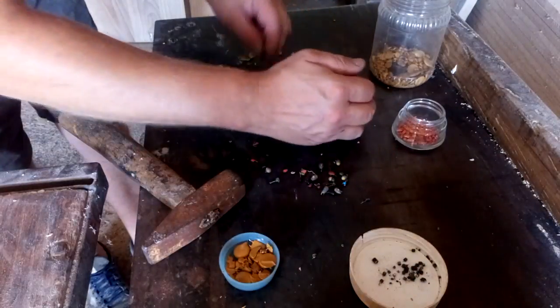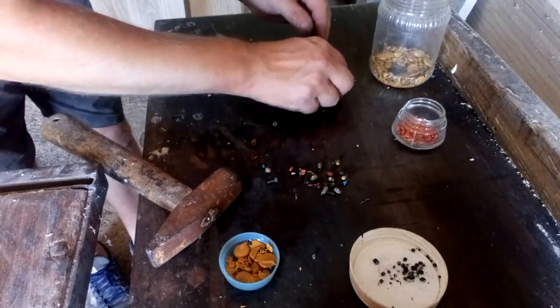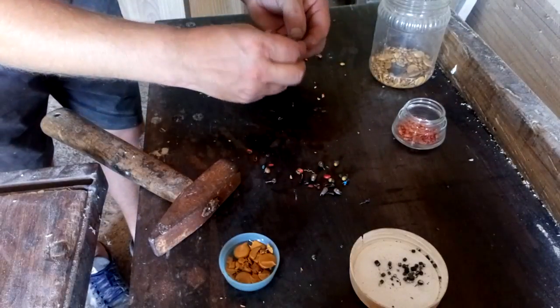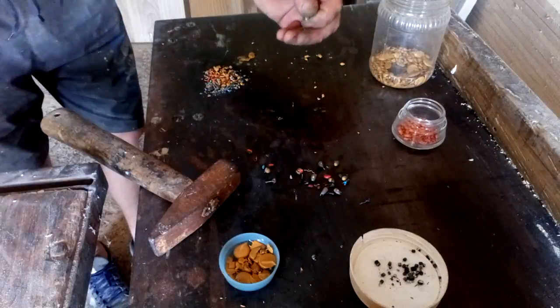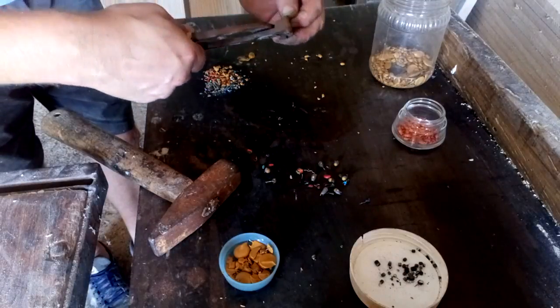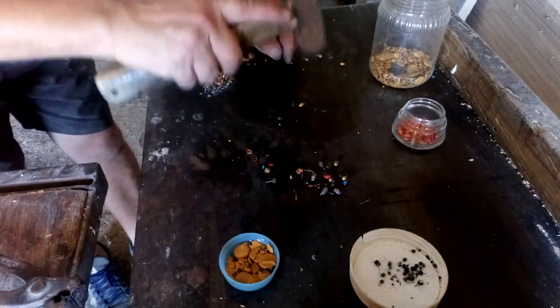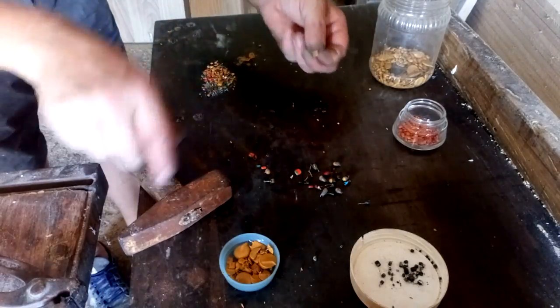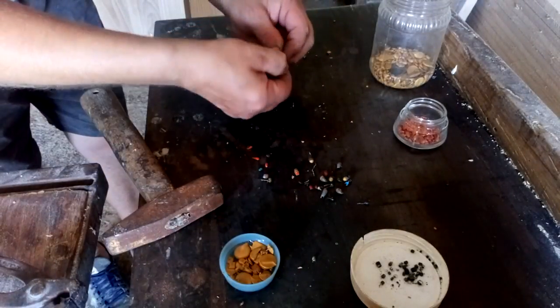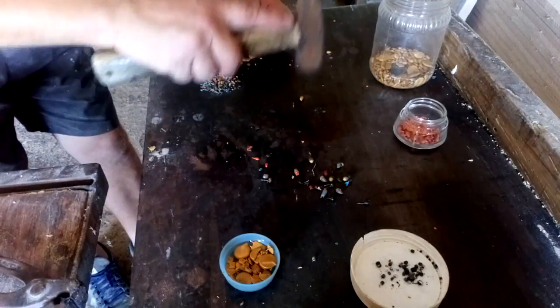We'll put that in the nitric batch. There is not an easy way to remove tantalum — hard work is the only way.